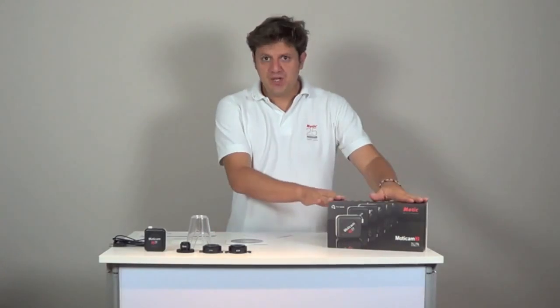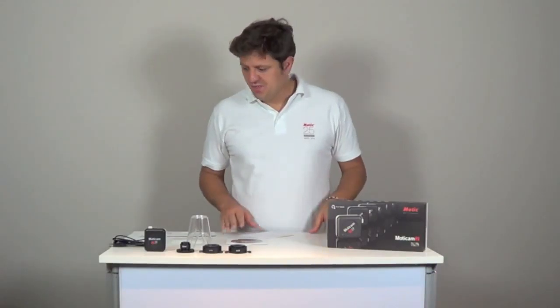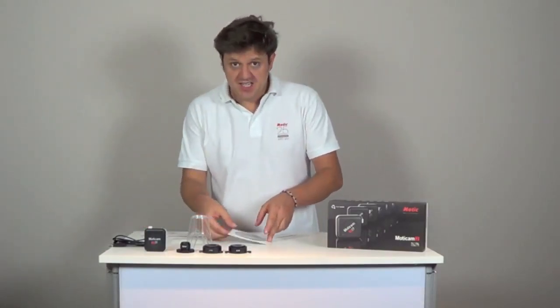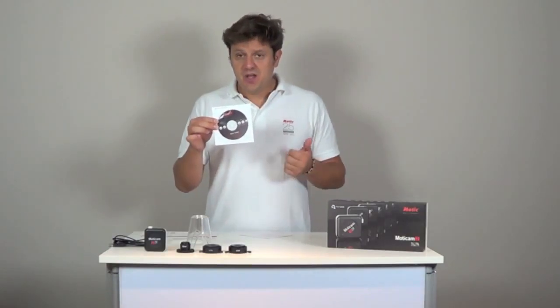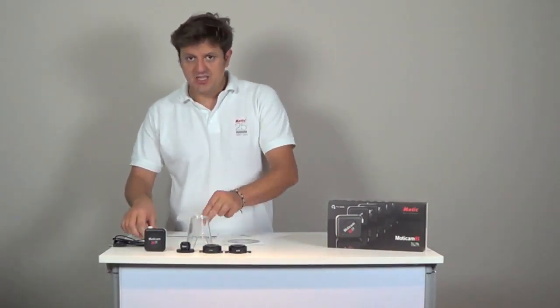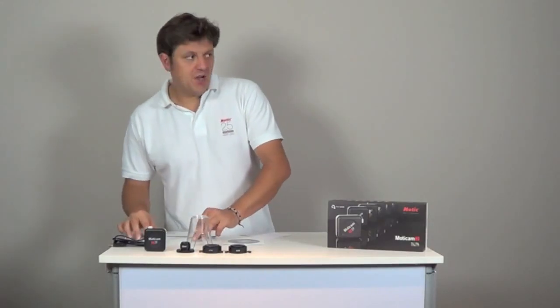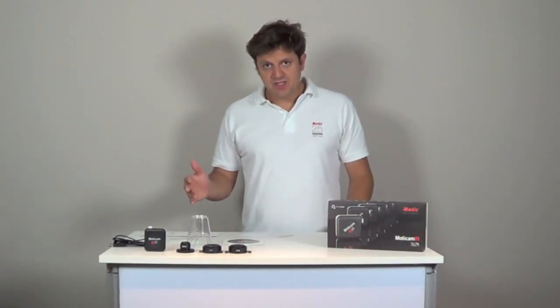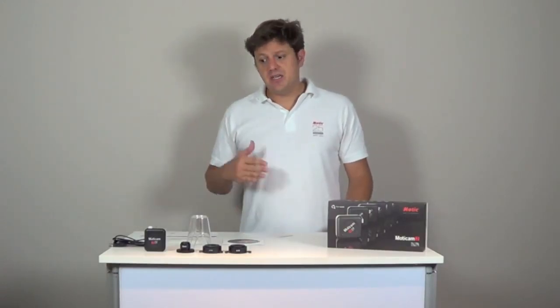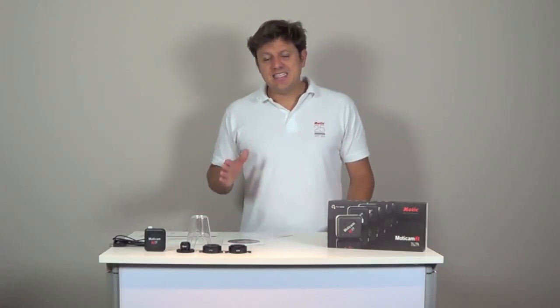All Moticam CMOS cameras come in one box with the tools you might need to mount your Moticam onto the microscope. You will find a quick start guide to help you install and use your camera. There is a CD with the software Motic Images Plus 2.0 compatible with Windows and Mac. In order to calibrate the software, there are two calibration slides, one in glass, one in plastic. Our website also has video tutorials with detailed information about the software and calibration procedure. Moticam is compatible with other software using universal drivers called Twain and DirectShow, and there is an SDK program that allows you to program your Moticam yourself.